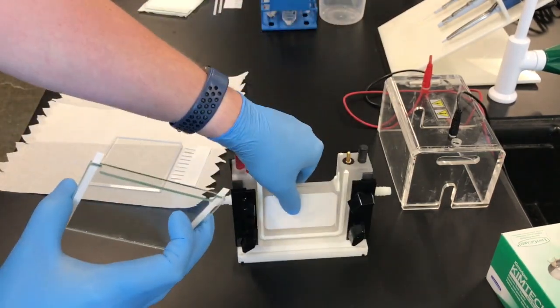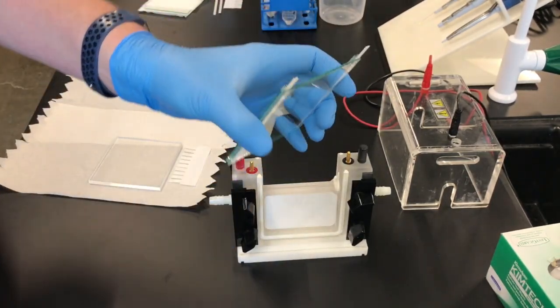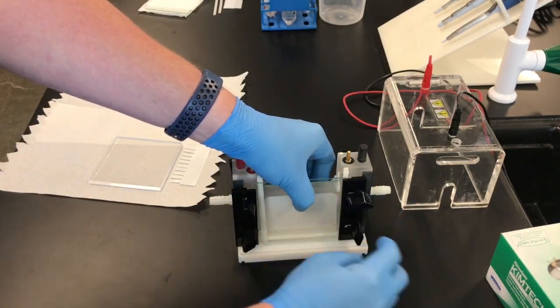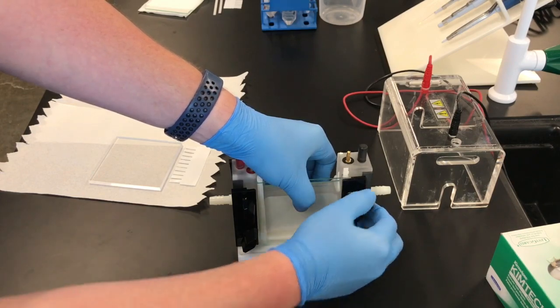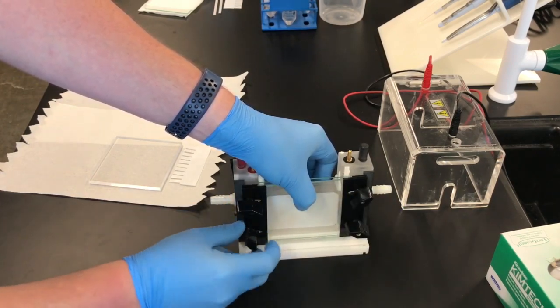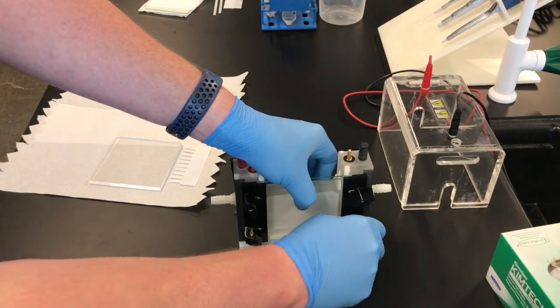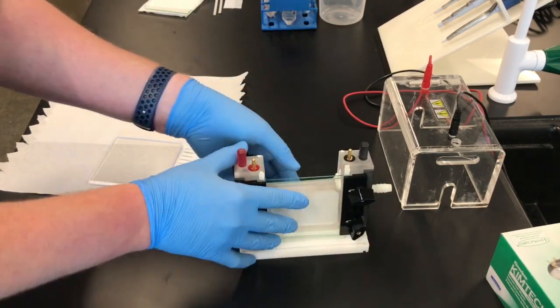We're then going to place it into the apparatus with the square glass plate facing outward and the notches facing inward. We can then tighten it using the clamps on each side. It just has to be finger tight, and make sure to go around and check that everything is tight.